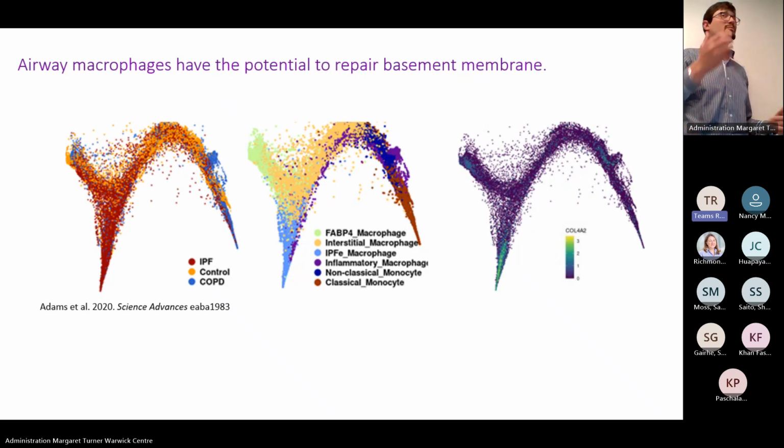We're going from data dependent acquisition to data independent, which is a game changer. You guys probably don't know a lot about mass spec, but basically it means we're detecting a lot more peptides and a lot more signal using this kind of approach. And with machine learning now, it's a lot easier to correlate peptide spectra back to the proteins. So we identify a lot more peptides compared to before. It's getting better and better.